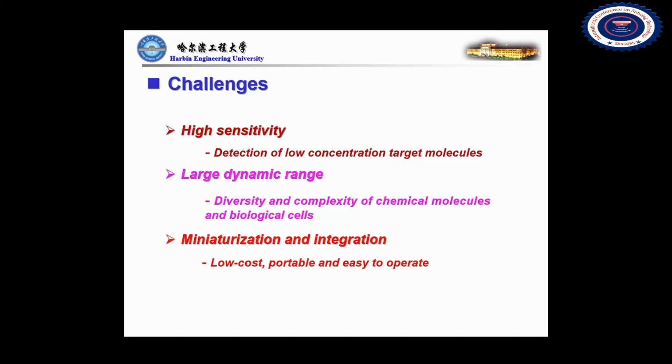Third, the integration of optical microfluidic devices is crucial for biochemical detection, DNA sequencing, and other fields. However, most optical detection functions for microfluidic applications require the use of external optical systems or the embedding of optical fibers. Although these devices are flexible, they do not have the potential for robustness, stability, and mass production, which limits the application of portable instruments.